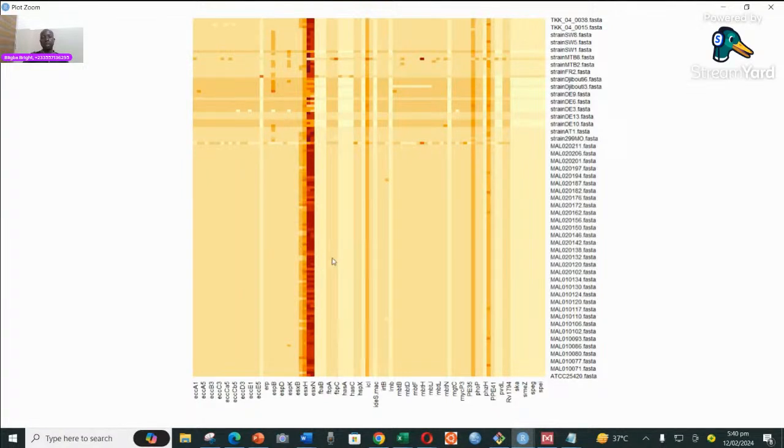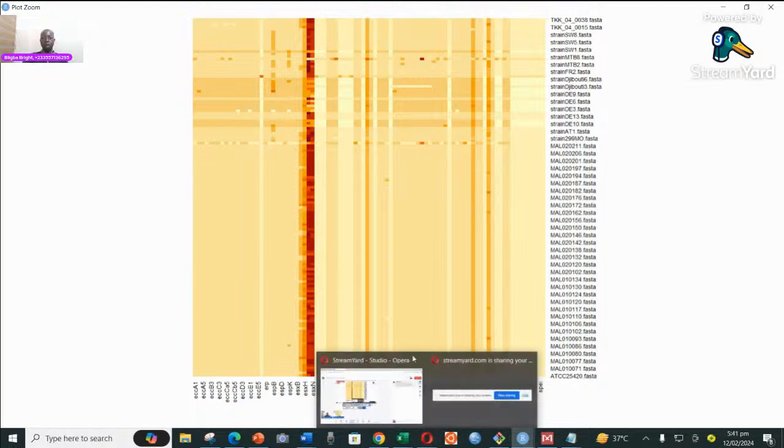And this is basically how to visualize virulent genes if you have already obtained them. I hope this video helps you to be able to do this. You can do this for antibiotic resistant genes as well. Just follow the steps one after the other. Now, let me summarize, and then I'll leave you.